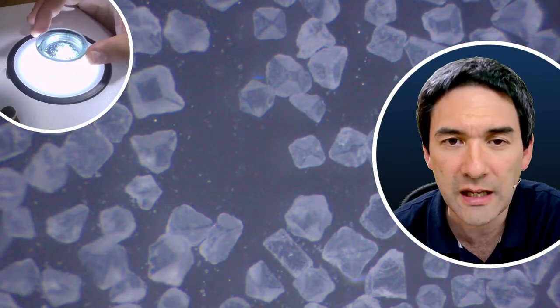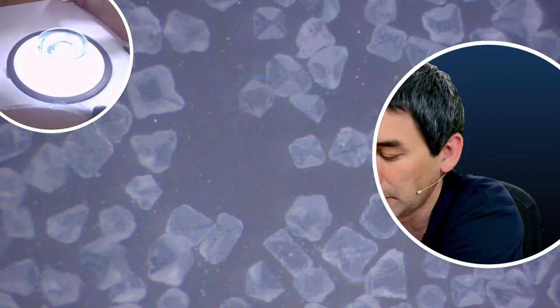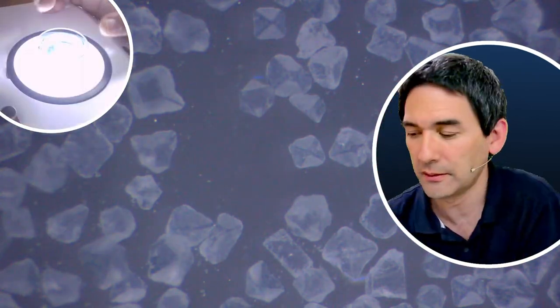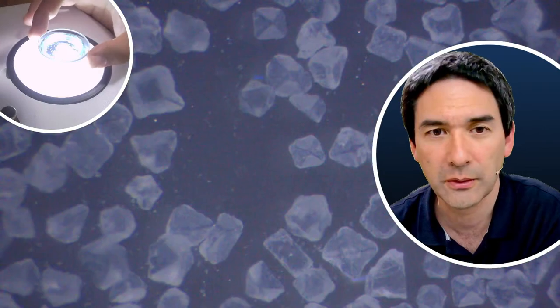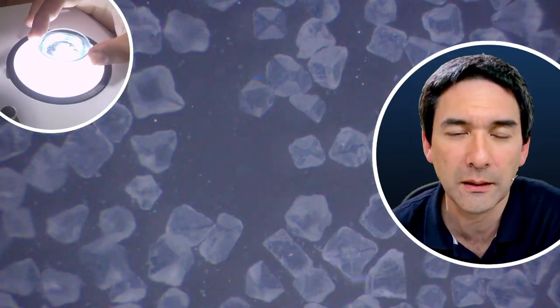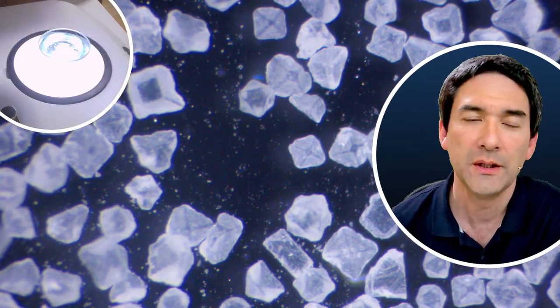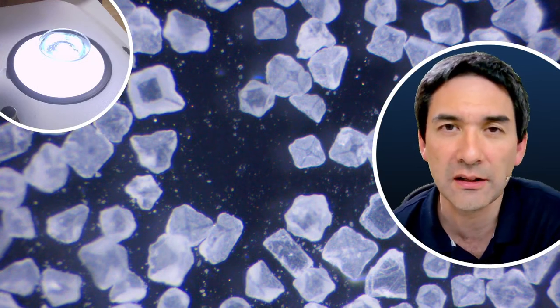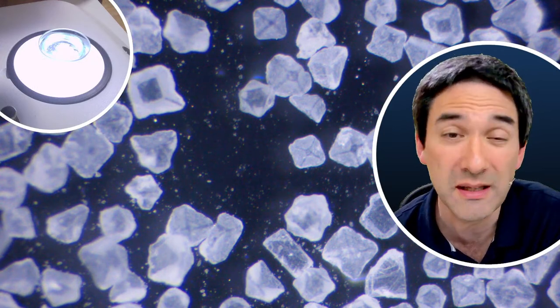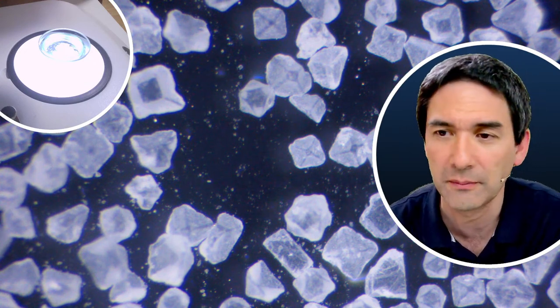Now the filters, they have a name. There's a little bit of stray light going on here, or maybe I have to turn it up a little bit more. Maybe the camera is a little bit slow. So here we go. Basically the bottom filter is called the polarizer, and the top filter is called the analyzer. My camera here is set to auto exposure, and this means it always takes a couple of seconds for the exposure to adjust a little bit.